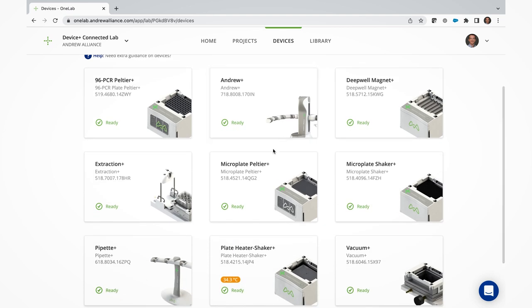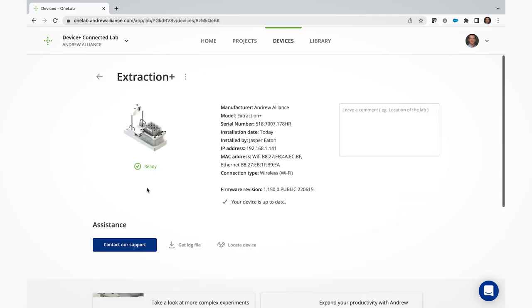Once paired with your lab, Extraction Plus becomes available in the Devices tab of the software and will automatically be suggested by OneLab during the execution phase of a protocol. Seeing is believing.